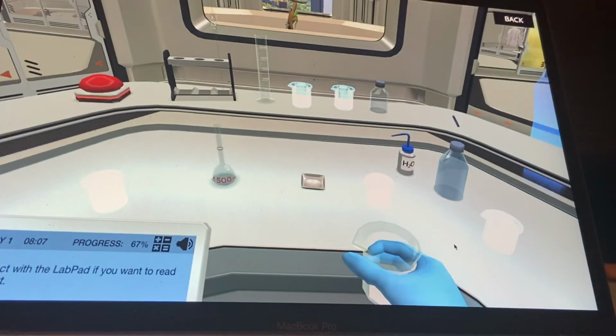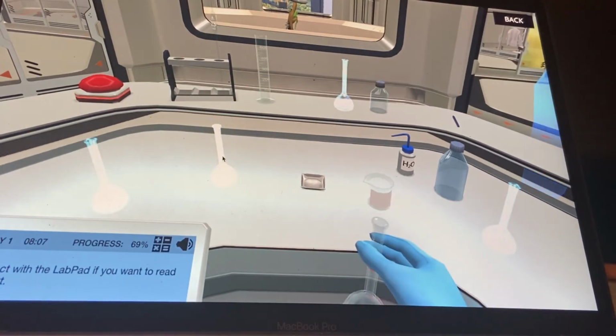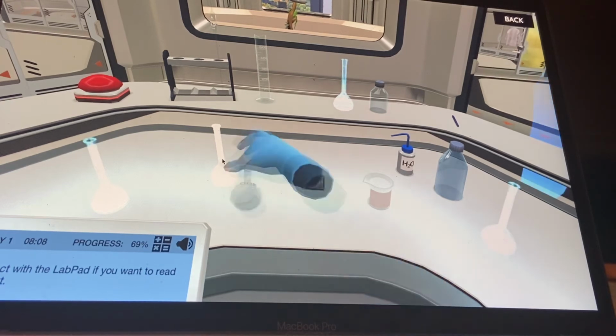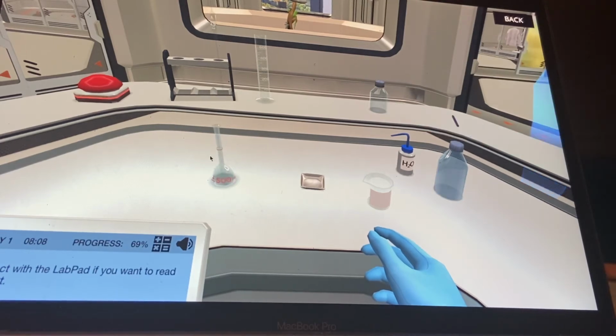Note that some liquids actually have a convex meniscus, where the liquid is at its highest in the middle, not at the edges. For those, it's important to do the reading at the top of the meniscus instead to get an accurate reading. Before filling the bottle all the way to the mark, we first need to make sure the salt is completely dissolved. Otherwise it will take up space now, but not later on when it's dissolved. This would make the concentration less accurate. Do this by first adding a large portion of the water to the volumetric flask, but less than the total volume, and mix the contents by turning it upside down a few times.